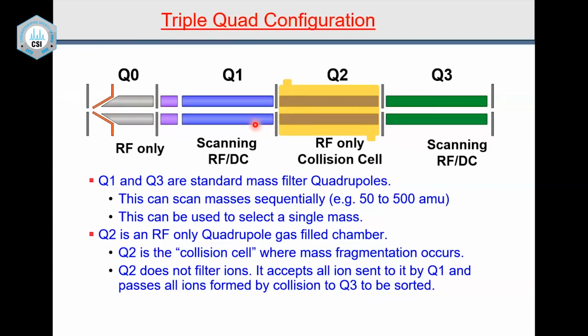And if you want to see the metabolite, after this dissociation you can concentrate on the metabolite. So if a molecule is coming here and you want to see metabolite B of that, then you say, I want to concentrate only on B and see whether B is formed or not. So if B is formed from A, send A, do the collision dissociation, and scan on B only. Let the quadrupole stay on that.